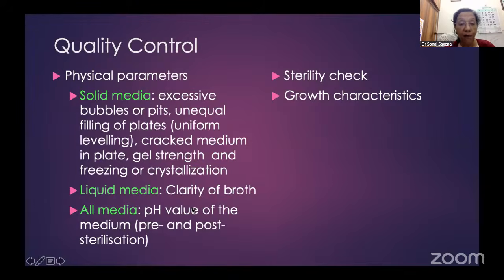The media may have overdried or dehydrated and cracked. So sometimes when you pick up a plate, you will find fine cracks on its surface. Sometimes you've measured 1000 ml because 60 grams had to go into 1000 ml, but somewhere down the line it became 900 ml.